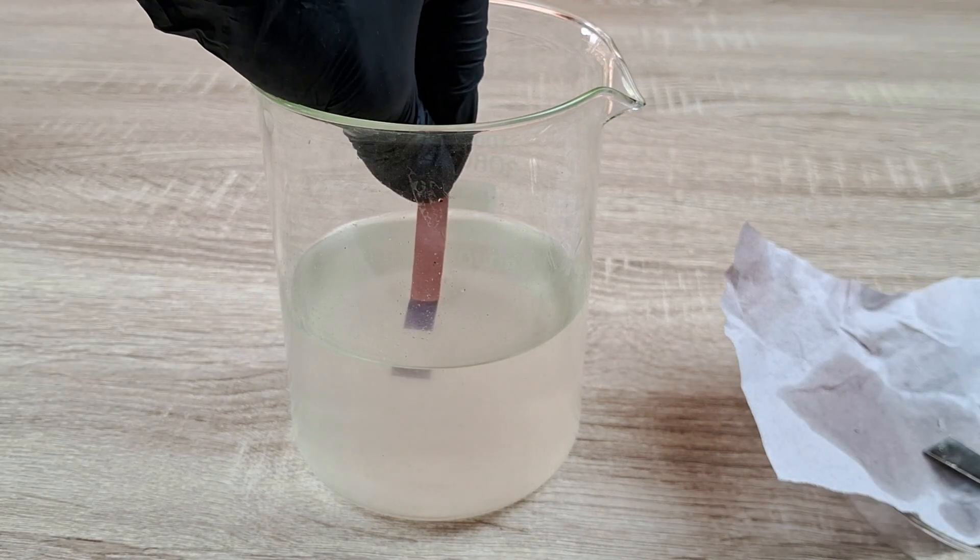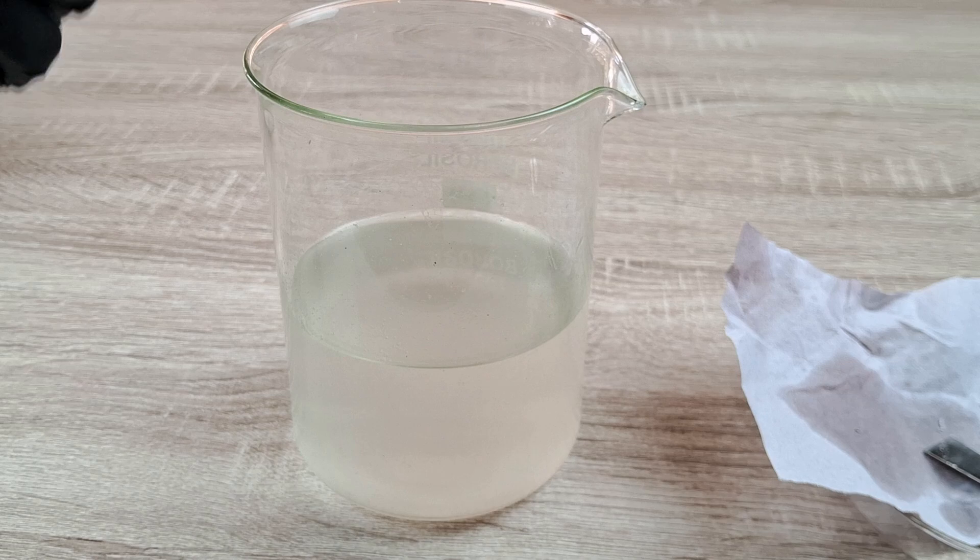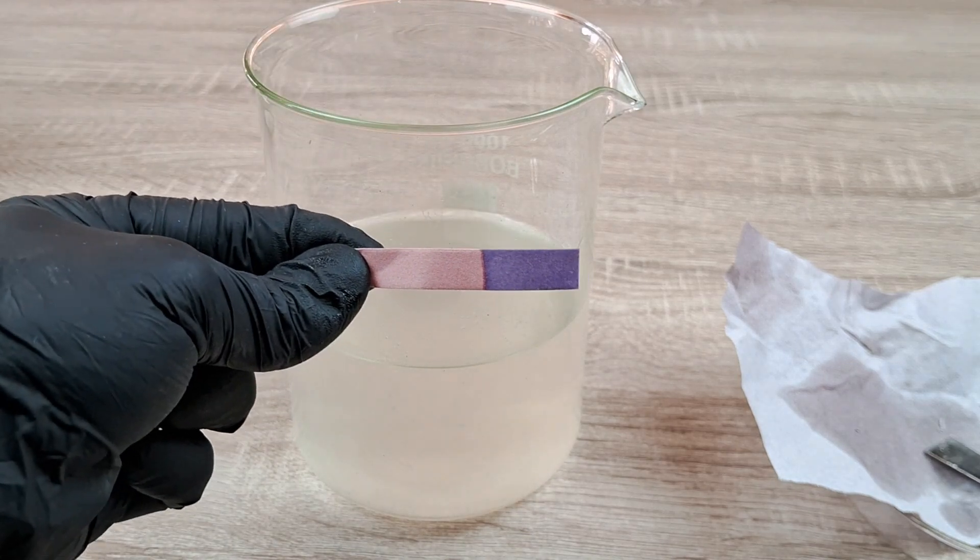At the end of the reaction, if you dip a strip of red litmus paper into the water in the beaker, the red litmus is seen to turn blue.